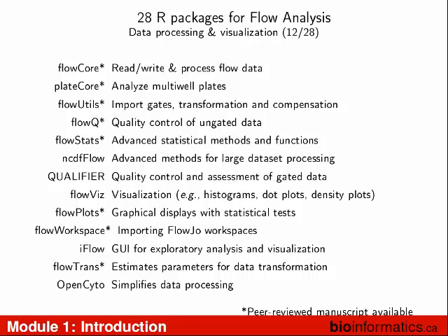Our qualifier, if you work with gated data, you can use that to check to make sure that the gates people have used are sane. We have really cool stuff for visualization, because R and Bioconductor are developed for doing other things, and some people have great ideas on how to visualize data. We can use a lot of that within flow cytometry data. We can make nice plots. flowWorkspace has been a fantastic development. Nothing against FlowJo, we use it all the time. We use it to figure out what people did, so we can automate that in R.